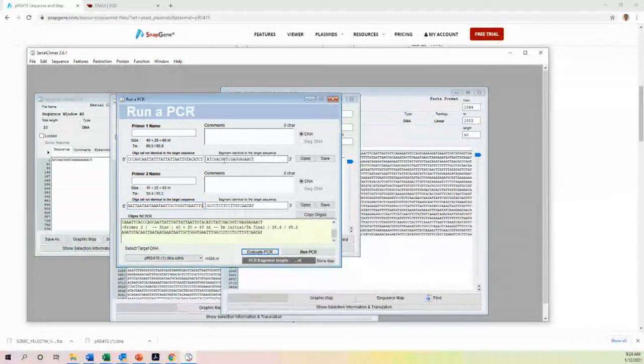After you perform the PCR for a few rounds, you generate a sequence with this completed length, from this 5' to the other end here. So after they generate these lengths of sequence, they will be able to anneal from 5' here all the way to the end of the reverse primer completely. That's why you have the second TM, and it's a little bit higher than the first TM, all right? So that's why you see two different TM.